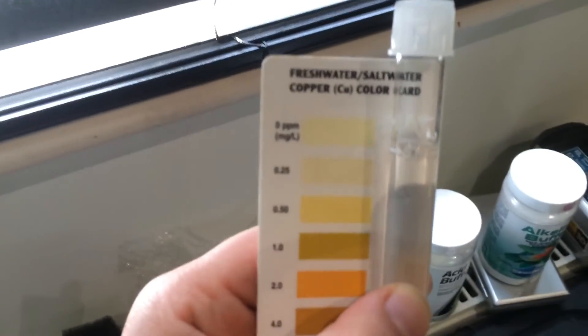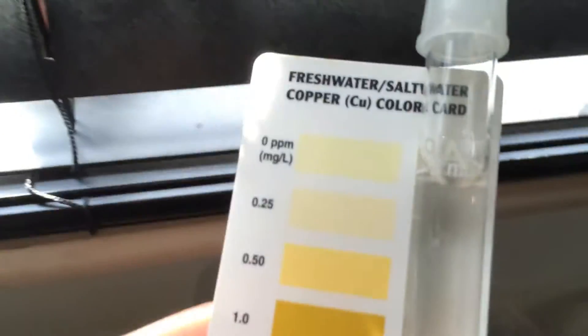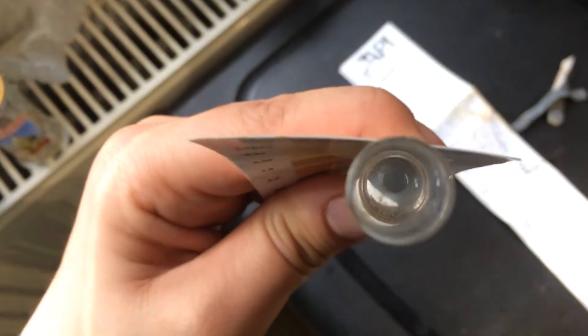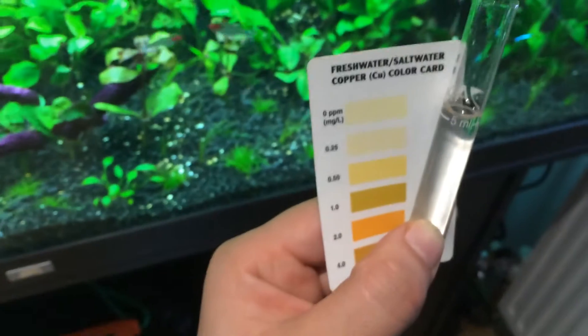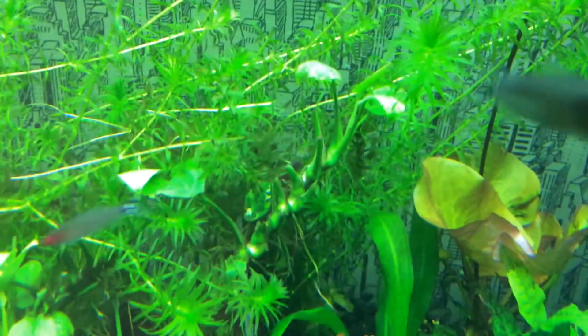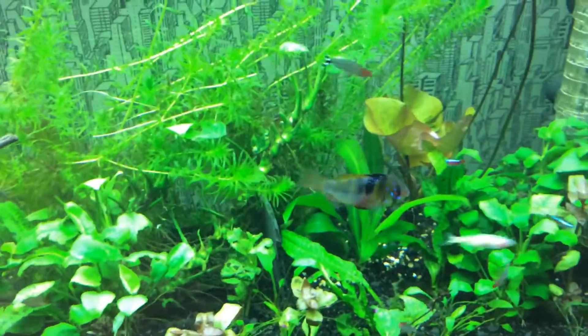Shake it a little and wait one minute for the color to develop. After just over a minute, I don't think it's changed color at all, so I'm guessing it's zero copper. I'm hoping that means the plants are absorbing all of the copper, which is a good thing since I've got four or five shrimp in there and copper isn't good for them.